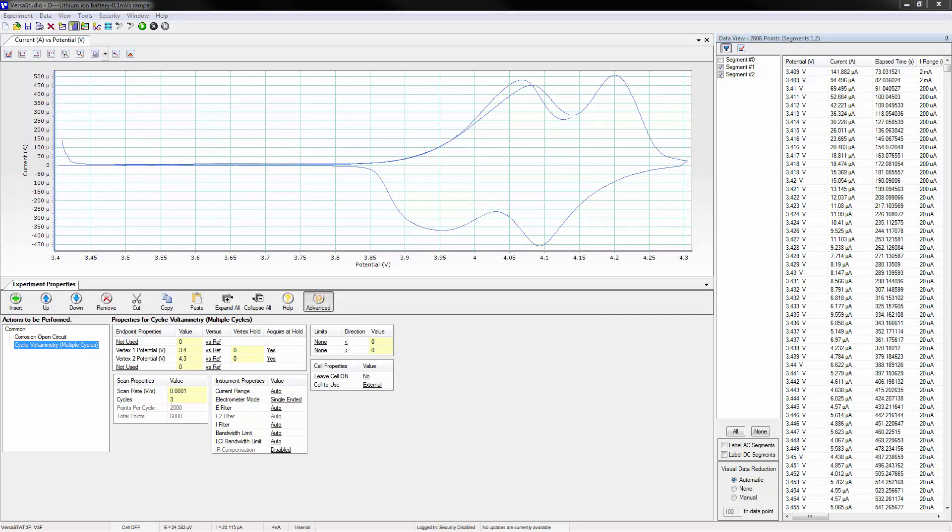VersaStudio version 2.46 offers several new features to enhance the user experience. One such feature is a new layout allowing the various windows to be docked and resized. This video will demonstrate the flexibility afforded by this new window docking layout.